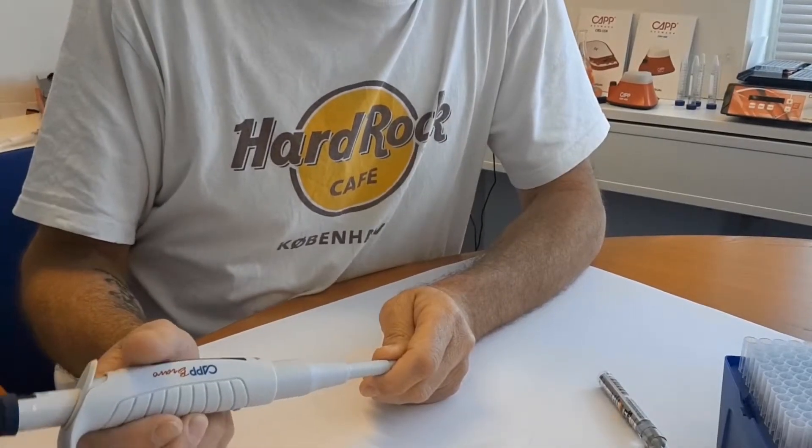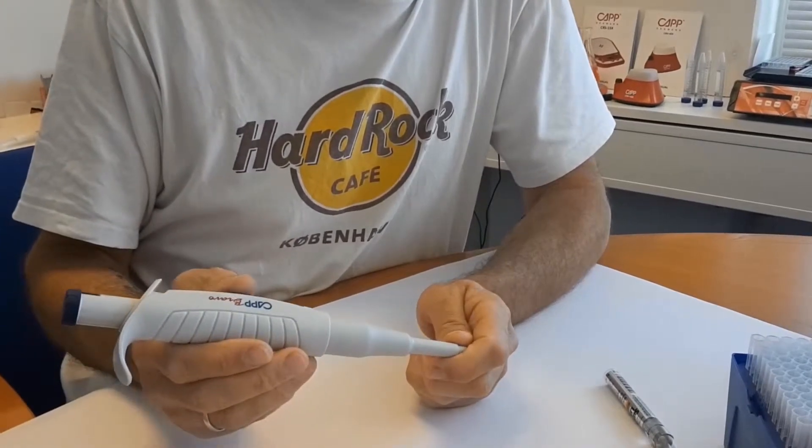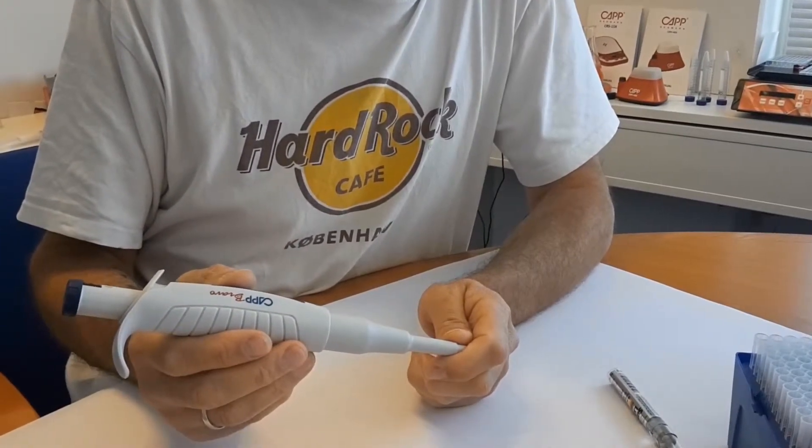Hello. Today we are going to troubleshoot the Cap Bravo 1000 pipette. Make sure you have watched the Cap Bravo 2 minute service check video prior to this one.